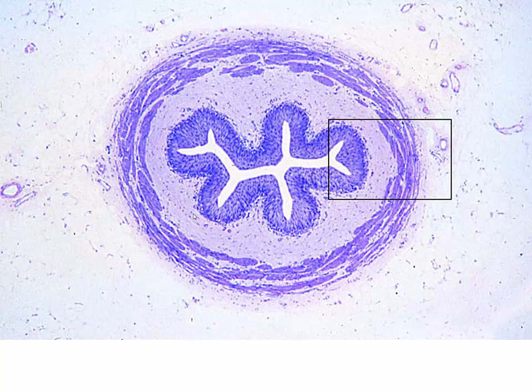Now, as we leave the kidney at the renal pelvis, the ureter is going to pick up that material. And here we can see our folded membrane. This is our mucosa. We've got our submucosa connective tissue, and then our muscularis on the outside. And then outside of that, we have adventitia.